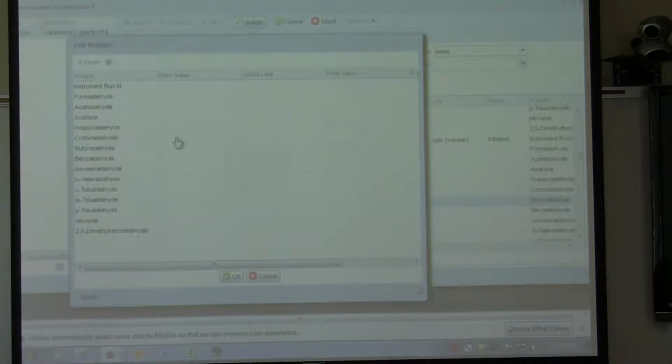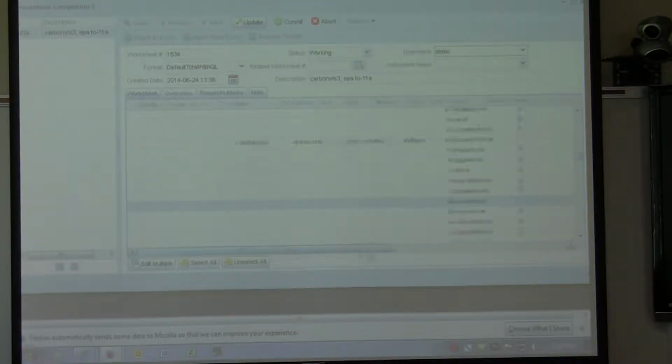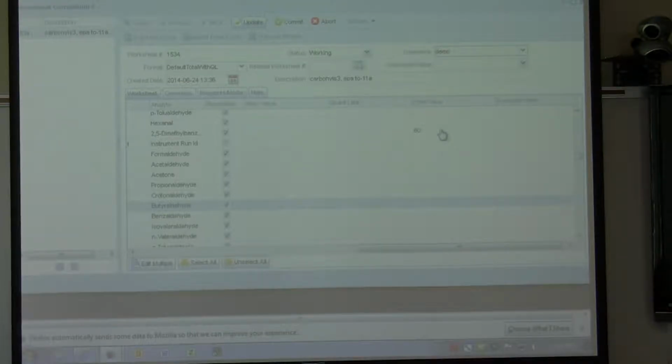You just, on the other page without the edit multiple. Can you copy and paste in there? It's going to be each cell individually, it's not like Excel. But that's why we created that. So you select the edit multiple to do that.